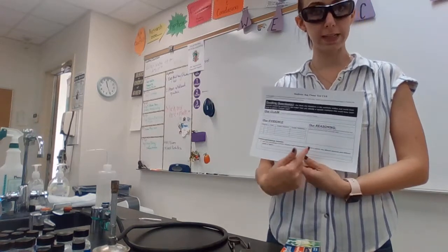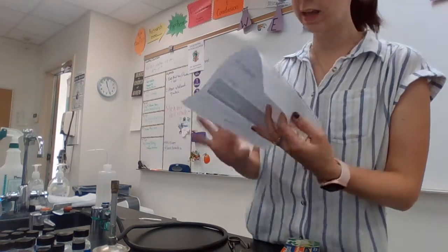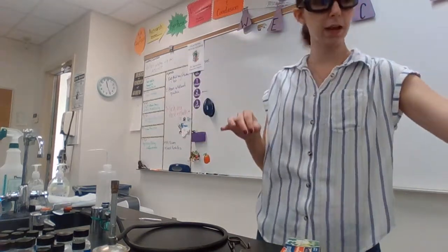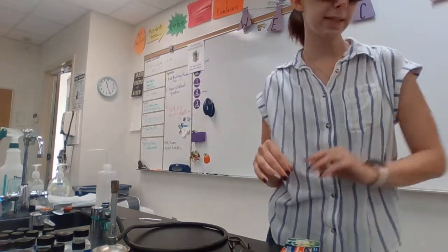So this you'll put in a complete sentence. The only thing not in complete sentences is your evidence portion. You'll just fill in the chart. And that's how you guys will end up doing the medicine bag flame test.